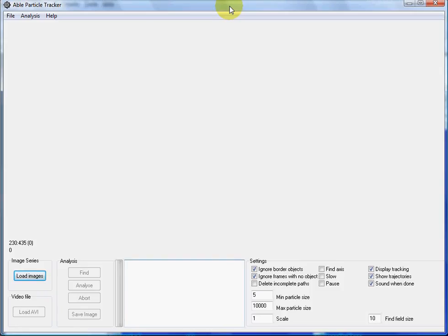In this demonstration I will show you how to use Able Particle Tracker to simultaneously track multiple particles. Let's load images first.